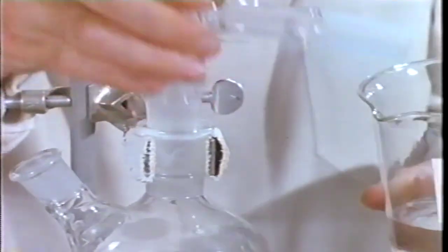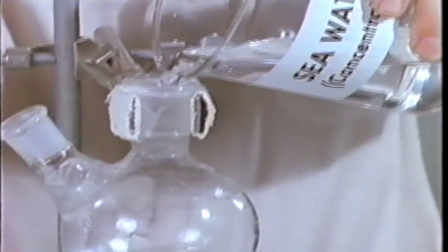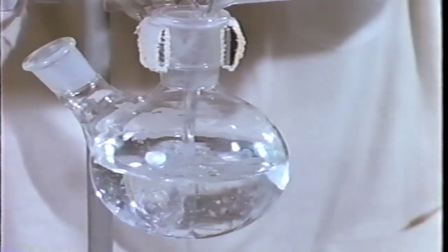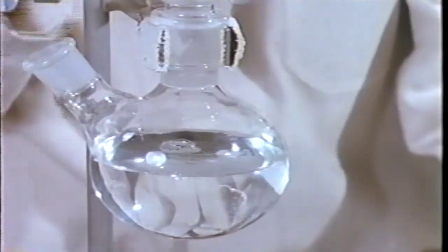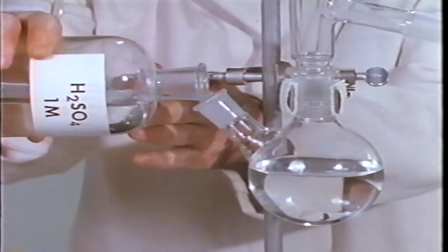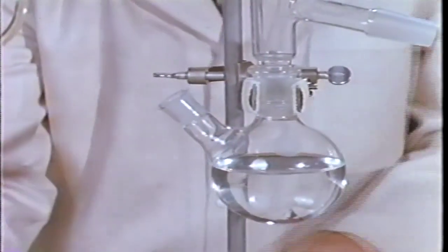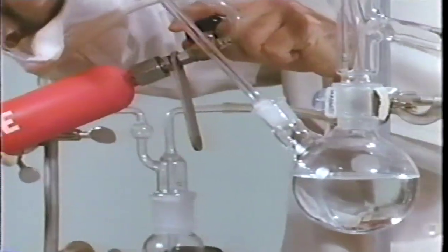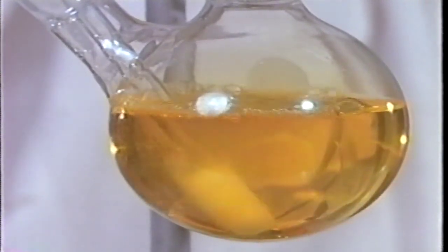Here is another portion of concentrated seawater, this time in a system designed to handle the gaseous bromine. We first acidify the seawater. When the solution is chlorinated, elemental bromine forms.